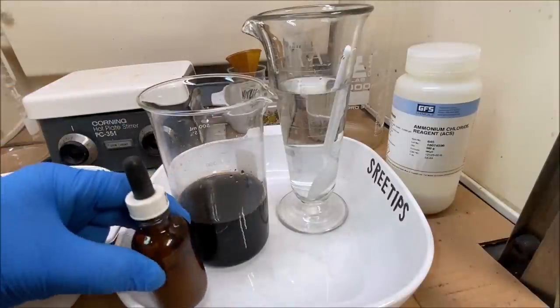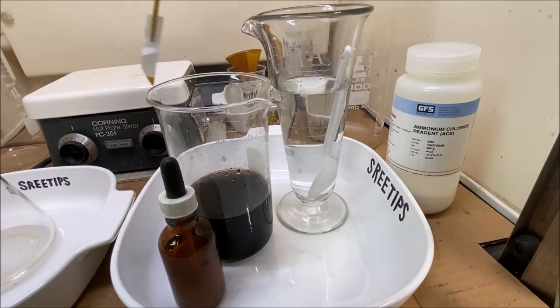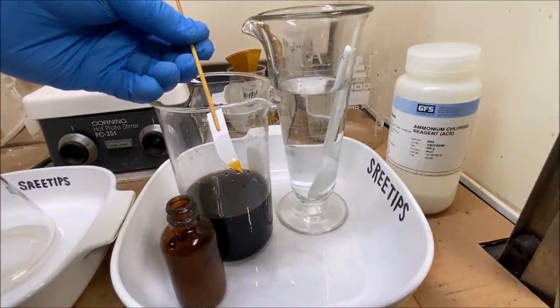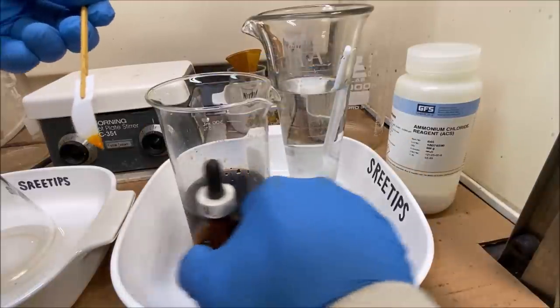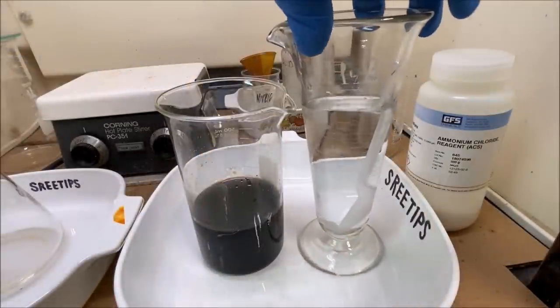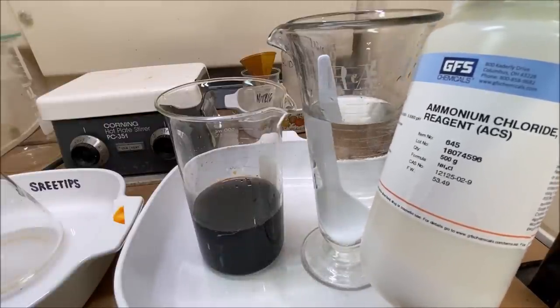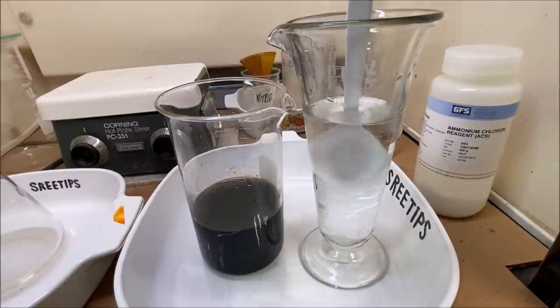Now what we'll do is get a little bit of this solution on a piece of filter paper. We're going to test it with stannous chloride just to verify that we've got platinum in solution. There you see that orange stain verifies that we do have platinum in solution. I have a saturated solution of ammonium chloride here. And saturated means that I've got enough ammonium chloride dissolved in there so that no more will dissolve.